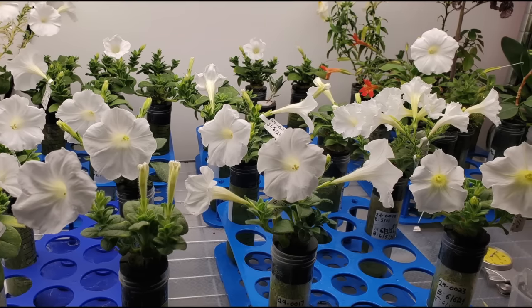And then you're just cramming bits of DNA into the cell, ideally in the nucleus, maybe, where then the DNA gets integrated basically randomly. Right. And so this is a shotgun approach. It's really not elegant. And as a result, it's like 2 orders of magnitude less efficient than Agrobacterium.